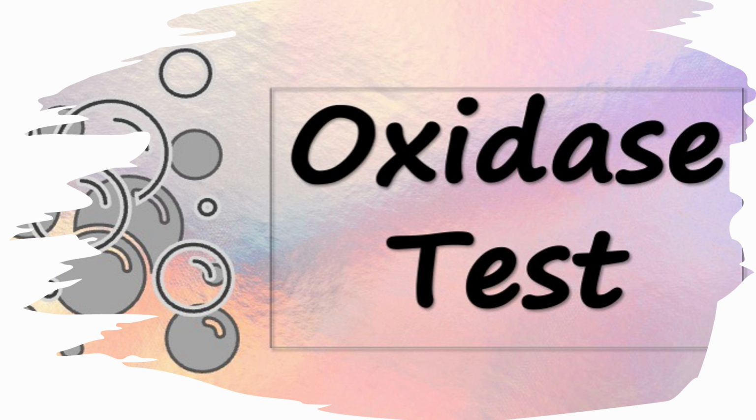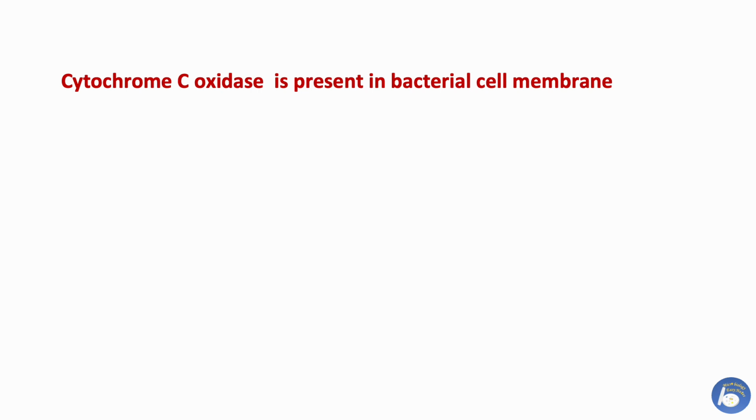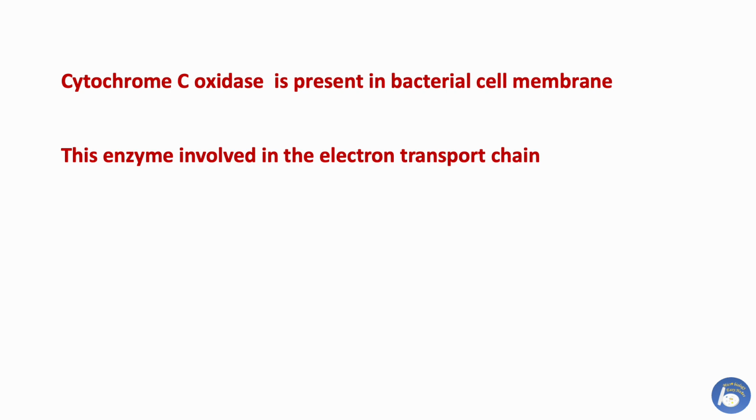Today's topic, oxidase test. The oxidase test is a biochemical test used in microbiology lab to detect cytochrome C oxidase enzyme in bacteria. The test helps in initial characterization of gram-negative bacteria. Cytochrome C oxidase is usually present in bacterial cell membrane, and this enzyme is involved in the electron transport chain, which is a crucial part of cellular aerobic respiration.